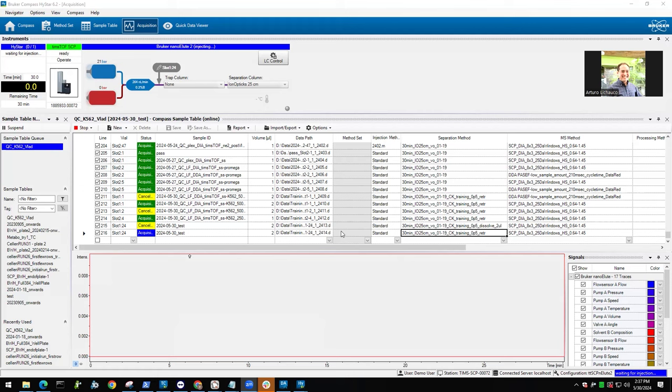While I had it open, what we have on it right now is the self-adhesive foil. I'm not the biggest fan of it, but quite a few LCs have issues with the self-adhesive foil because you have quite a bit of glue on the inside, and it might get stuck on your autosampler needle, or you carry it somewhere and you mess up your system a little bit.